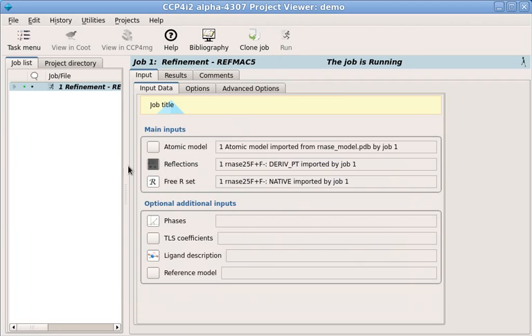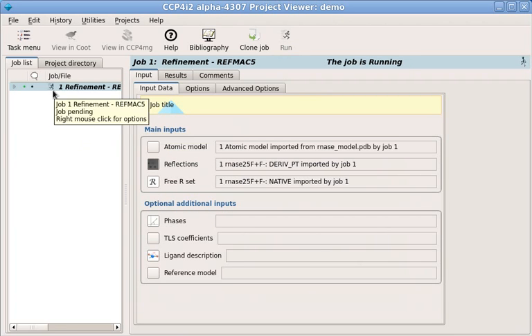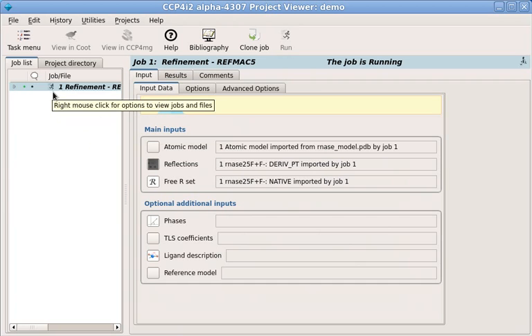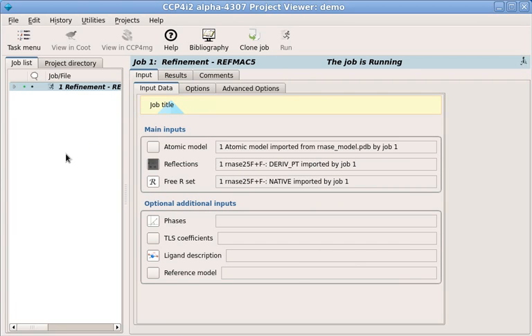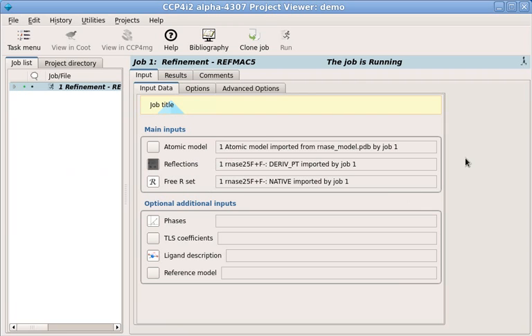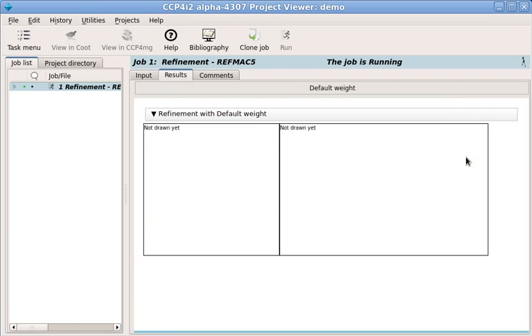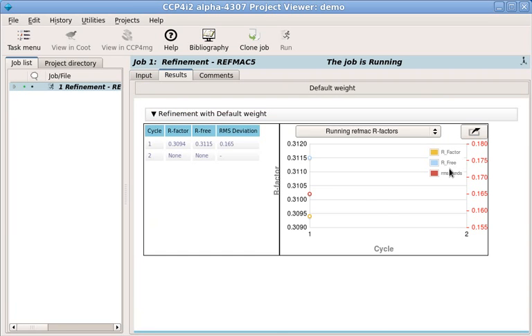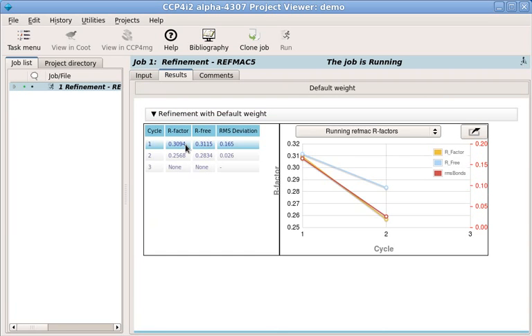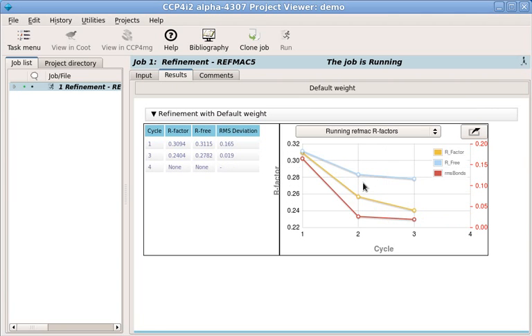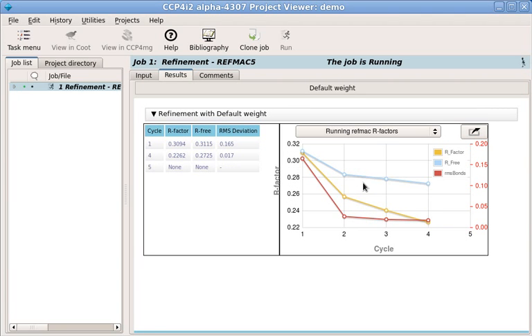The icon in the job list will change to show that the job is running. As soon as some results are available, they'll be shown in the Results tab. We can see the most important statistics as a table and a graph, including the R and FreeR factors and the geometry statistics.